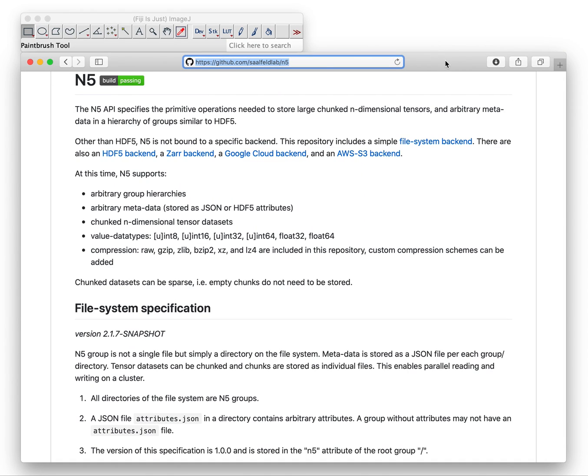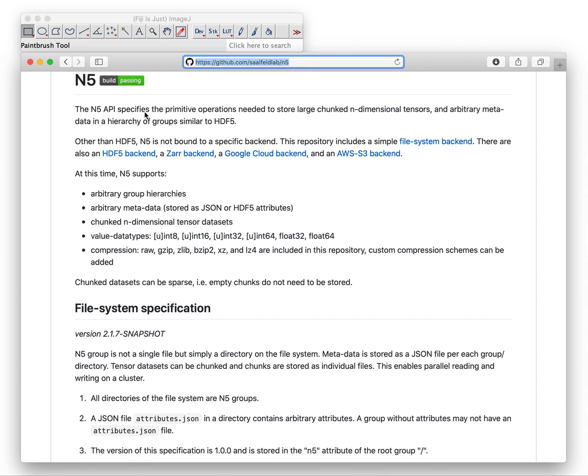Today I want to show you a new feature of BigStitcher, which is that it finally supports N5, the file format. This was developed by Stefan Saalfeld. Here you see the GitHub link if you want to learn more about it.